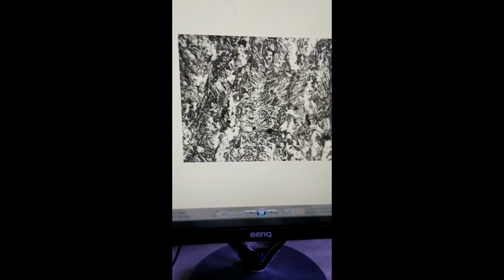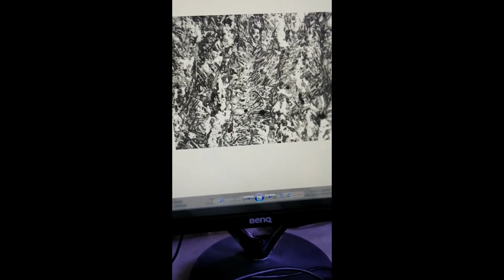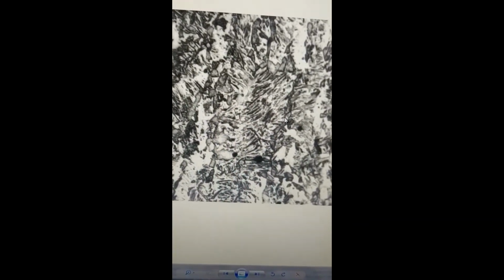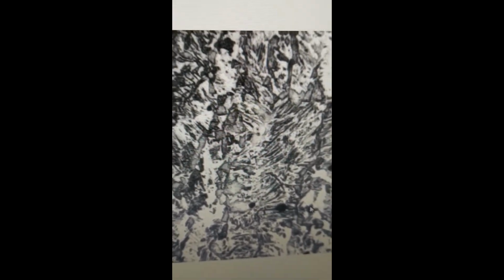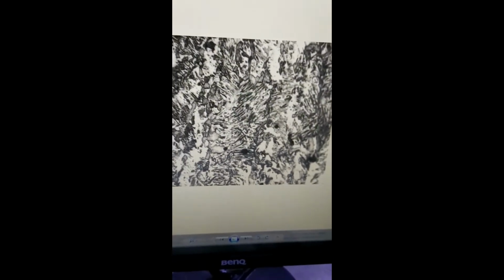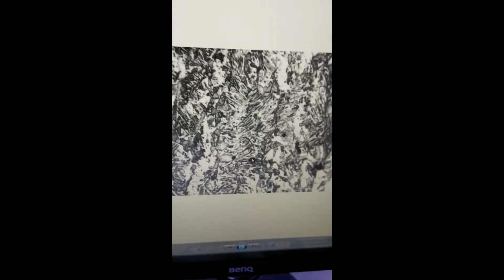In this zone, you can see lines of ferrite break up the pearlite areas, and the grains are not in circular or rectangular shape. It is a needle shape, and it will intersect ferrite and pearlite both, and there are no special grains as in our unaffected zone area.